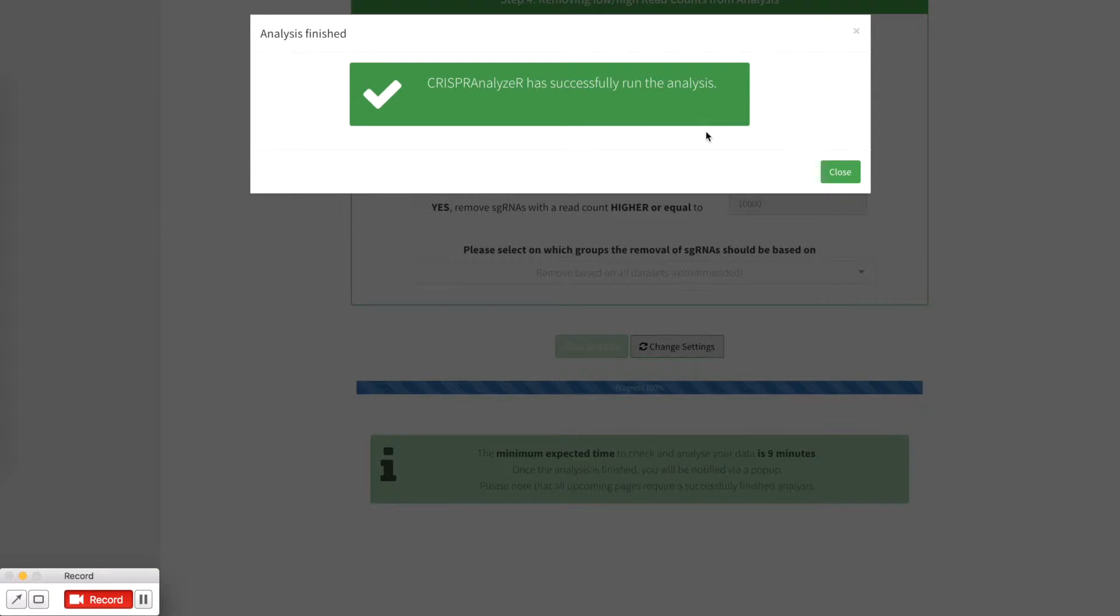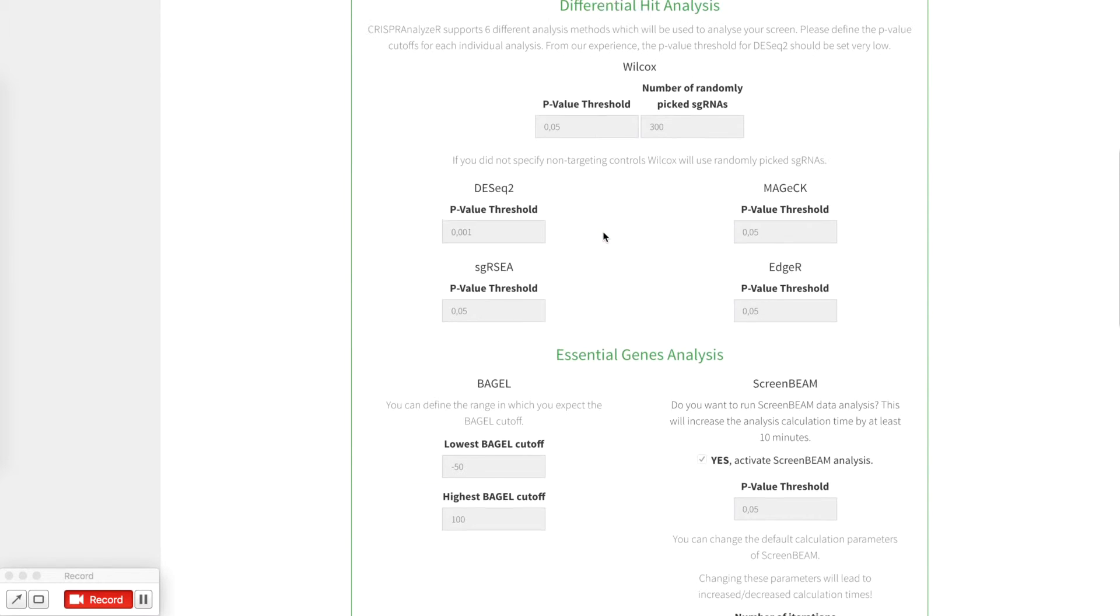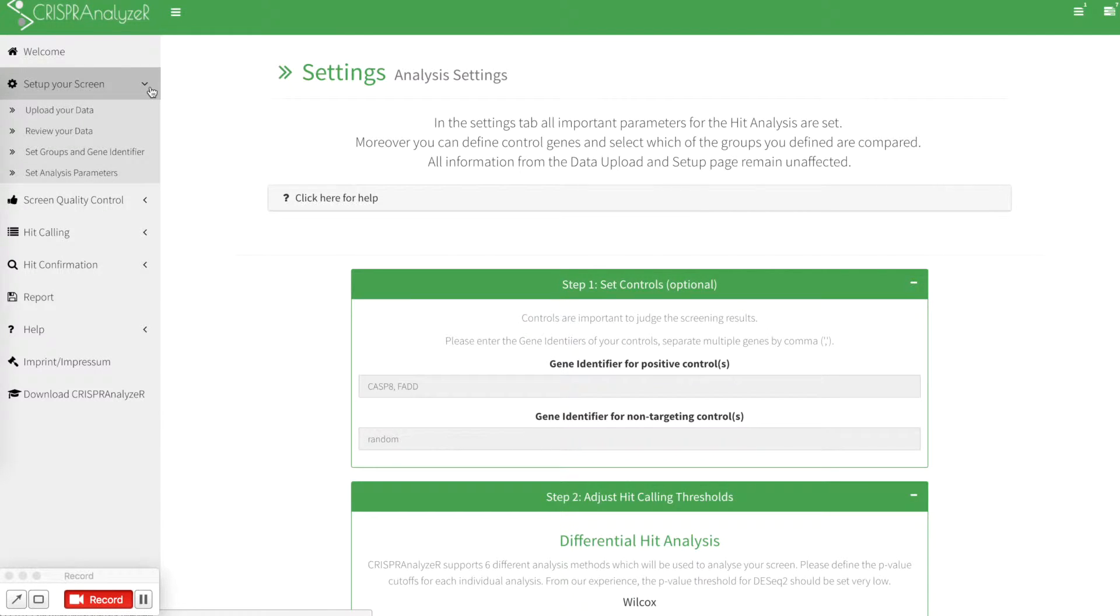After CRISPR Analyzer has finished running the analysis, you will see this pop-up telling you that the analysis is done. Just click on close and head on to the next session. After you've finished, you set up your screen and the analysis is done.